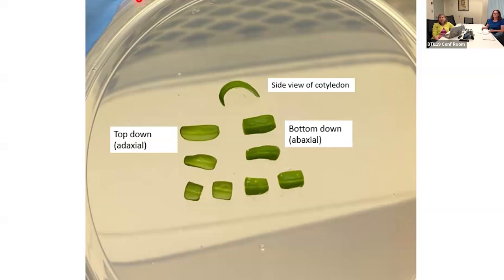Some of this was in place even before I came. We didn't tweak the pH when we did this, so I assume the people before us did look at pH, or were following something in the literature, and used a pH of 6. You're right, 5.8 is more common, but that was already part of the protocol at that time.